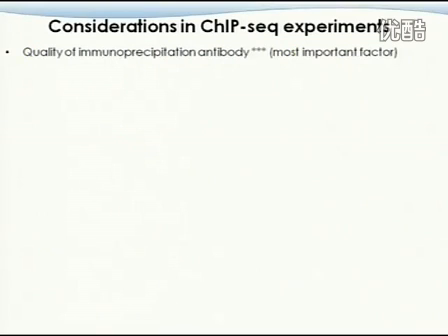And we have heard so many bad stories about ChIP-seq, where after they spend so much effort to get the platform and get everything figured out, they found out that they didn't really immunoprecipitate anything. And actually, we have some data sitting in our lab that is in that situation, which is completely wasted. Not only the sequencing cost, but personnel cost as well.